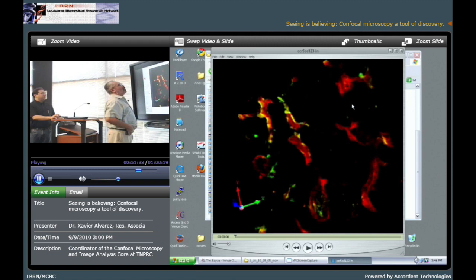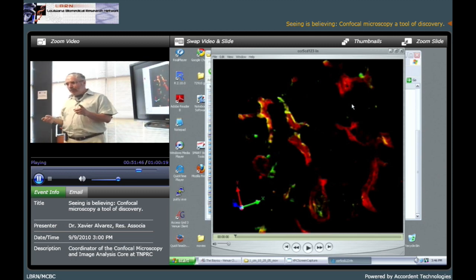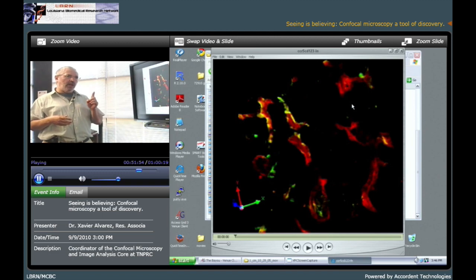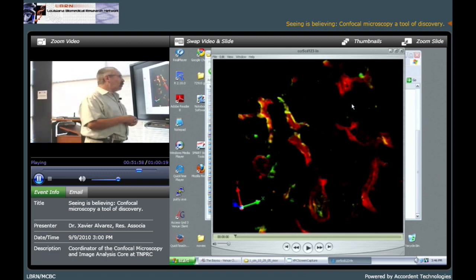It's CCR5. CCR5 is a co-receptor for the cells to bind HIV. Normally they bind to CD4 and one of the co-receptors. This is the co-receptor that is used the most in monkeys.